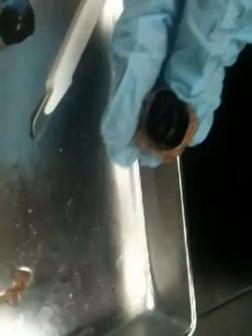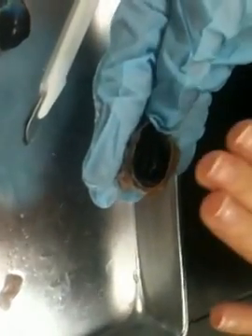Okay, and then you can see there's this gooey gel stuff behind the lens. That's the vitreous humor. Okay. And then the aqueous humor was in the eye too. You probably saw some of it coming out when you first opened it. So it's liquid, and you lose all of that when you cut the eye open. But the vitreous humor along with the aqueous humor are what's keeping the shape and the pressure in the eye, and they're pushing the lens. So when you open this up, you should have seen that the lens was right there. So that vitreous and aqueous humor are pushing the lens in place along the back of the ciliary body and the pupil.